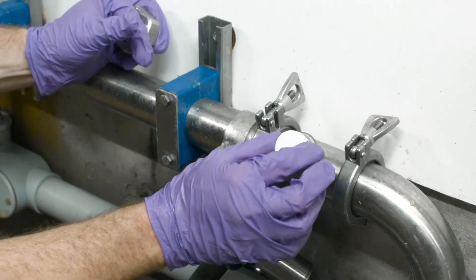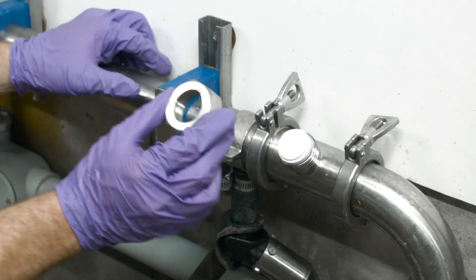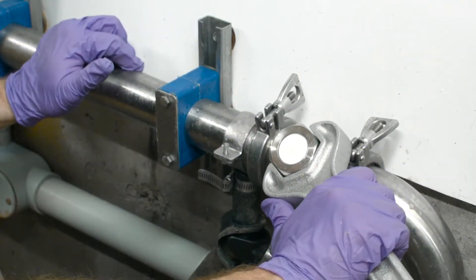Insert the septum into the stainless steel port and hand tighten the nut over the septum. Then, tighten the nut one-eighth turn with a wrench.